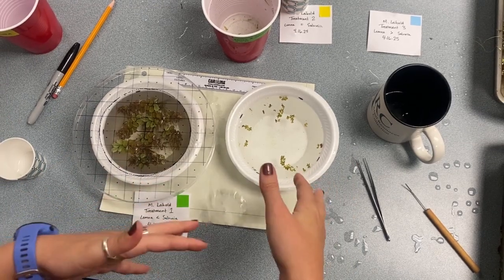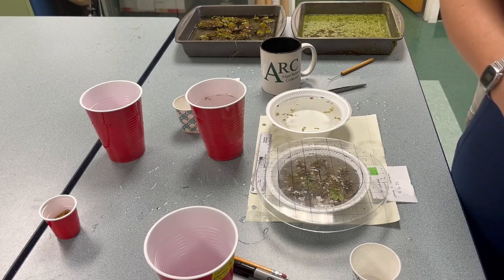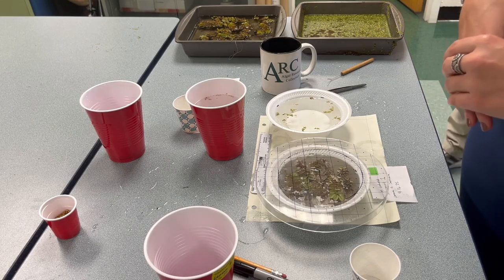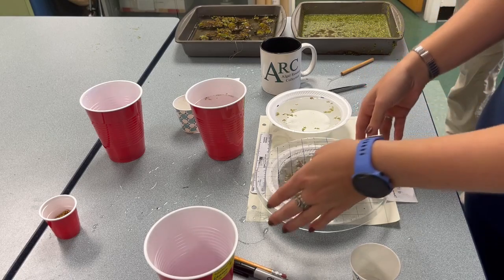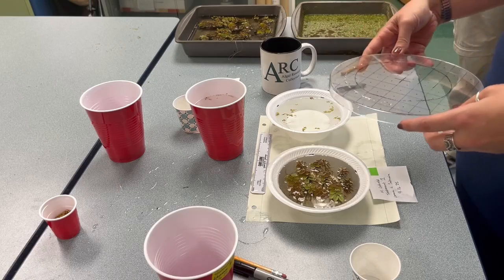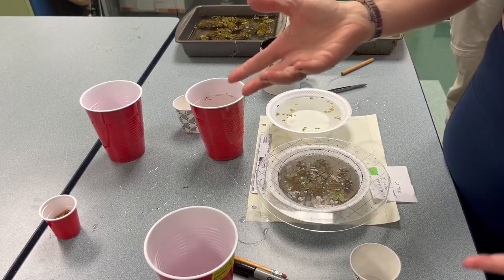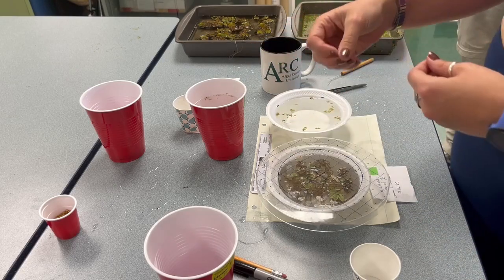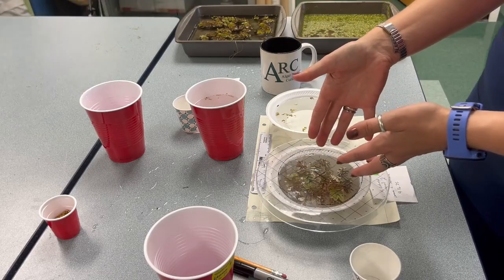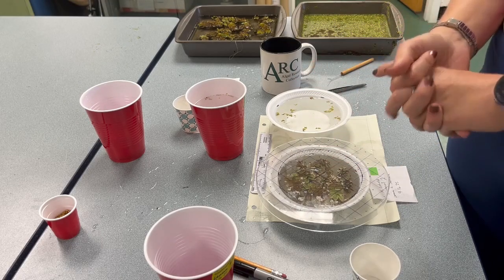And you do the same for the other species, and then you can use that percent cover to get the approximate area. So the total surface area of the water here is 113 centimeters squared, and then you can use your percentage to say, okay, well, this percentage of the total surface area of the water was covered by this species, and that will give you an approximate area of coverage for the species.